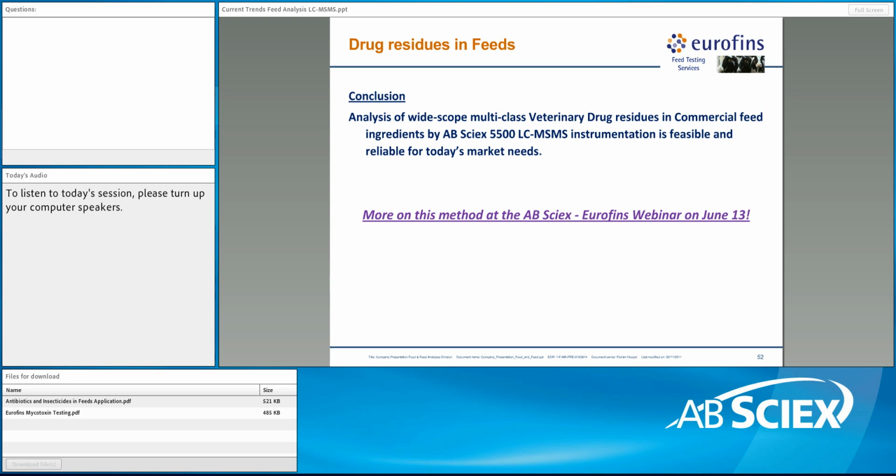Okay, thanks. Andre, did you have anything that you would want to add about the analysis of amino acids using LC-MS/MS? Yeah, we did some work on amino acid analysis in all different kinds of matrices. But like John said, we found it more appropriate for body fluids. It's quite popular in clinical laboratories, and we used a specific derivatization technique based on iTRAQ to enhance quantitative performance. But I would agree for food analysis, especially dirty feed samples, there needs to be some more work done before that becomes routine. Great, thanks.